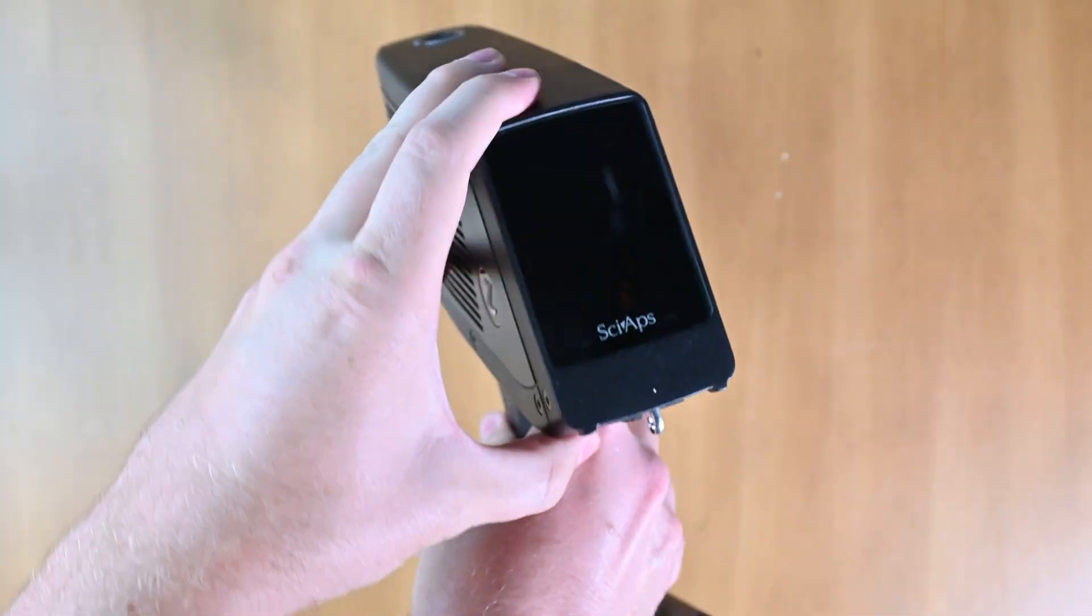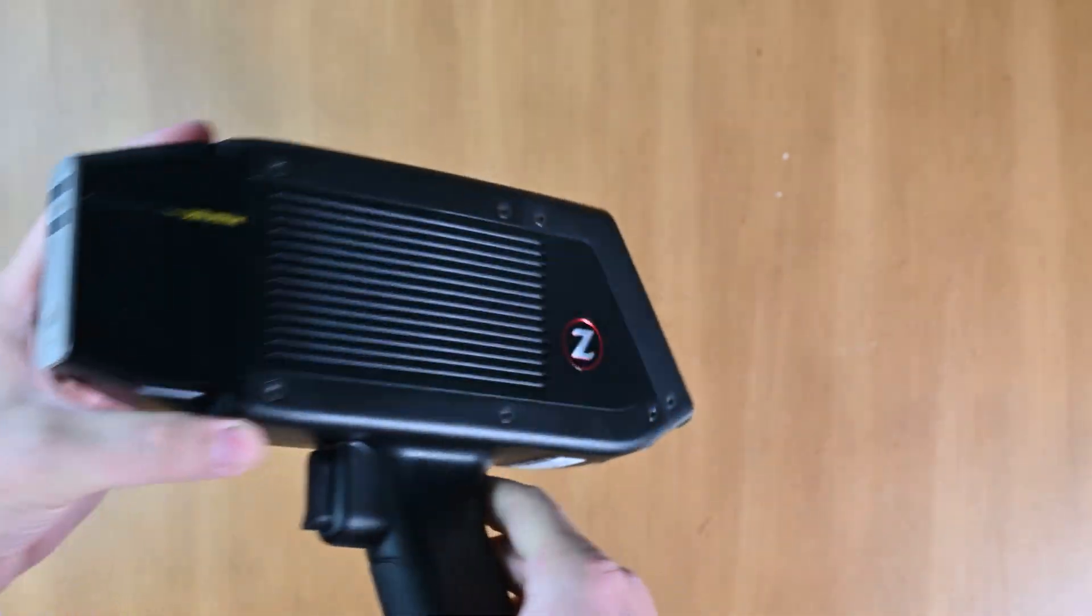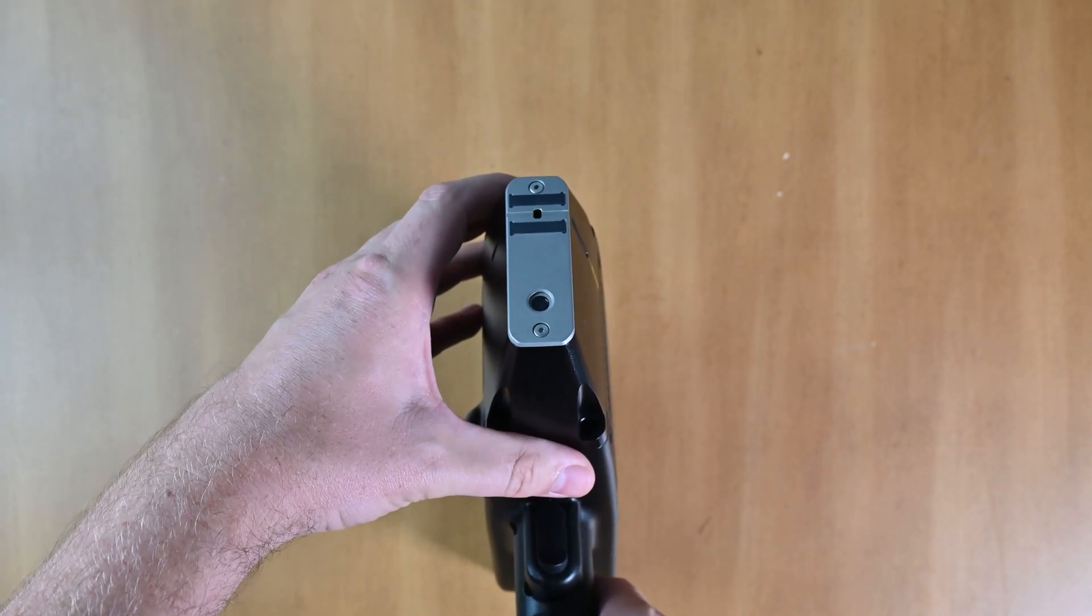The first thing we're going to do is make sure our analyzer is powered off. Now, turn the analyzer on its back, this back slant here. What you can do is just set that on a desk, a nice flat surface.